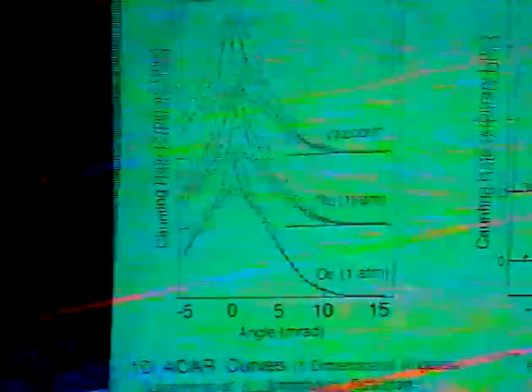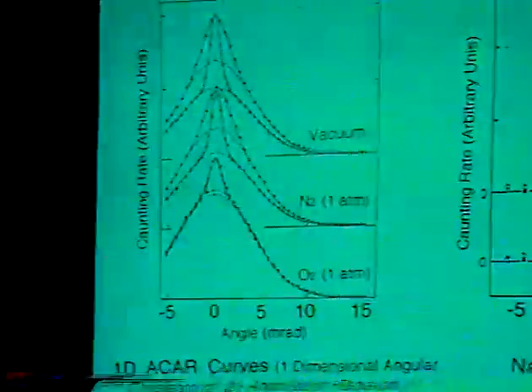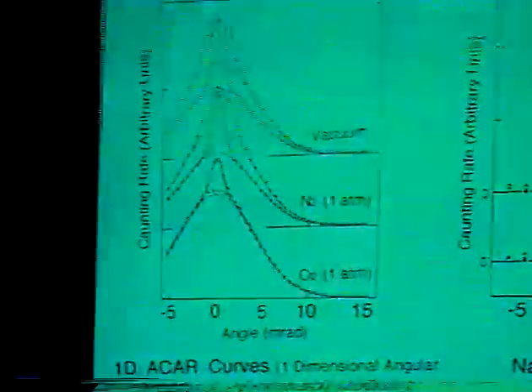This figure shows an ACAR spectrum under vacuum and under 1 atmosphere nitrogen.